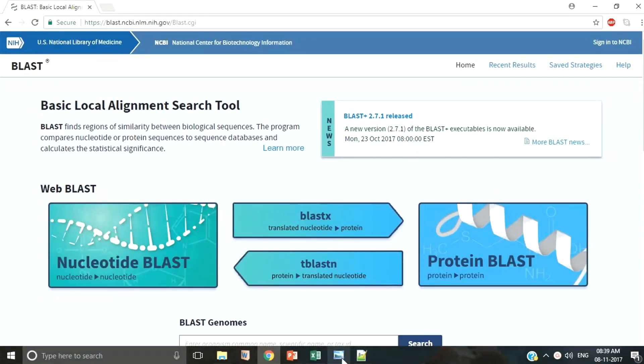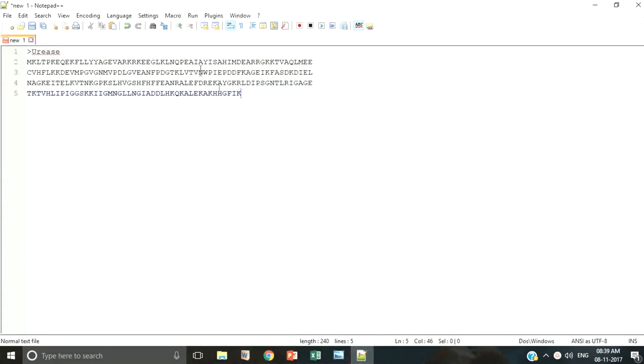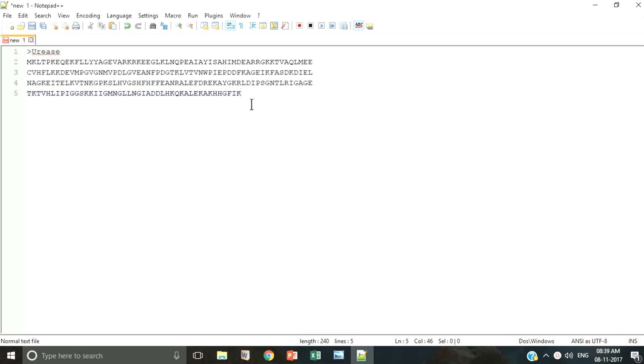Here we have extracted some protein from a bacteria and we want to know what it is. So we must choose protein protein BLAST in order to compare it with the existing protein sequences in the database.